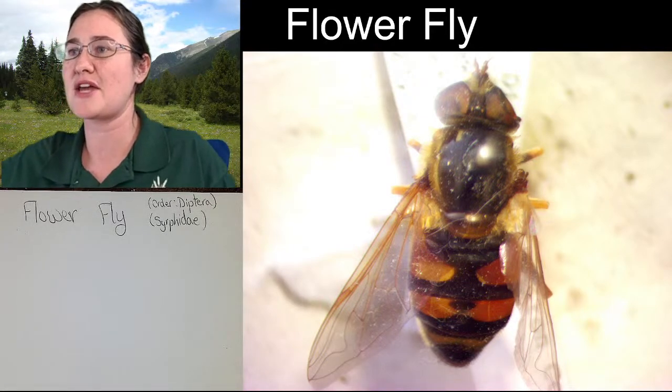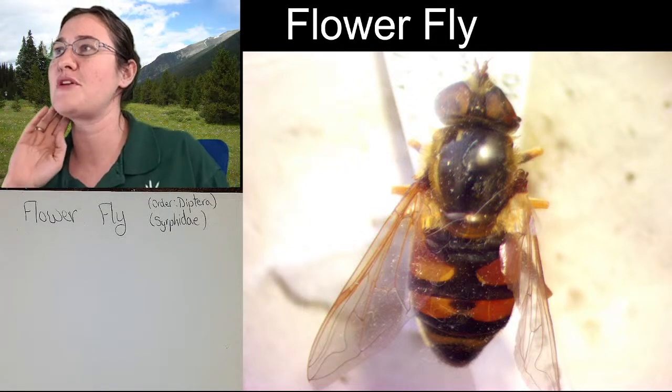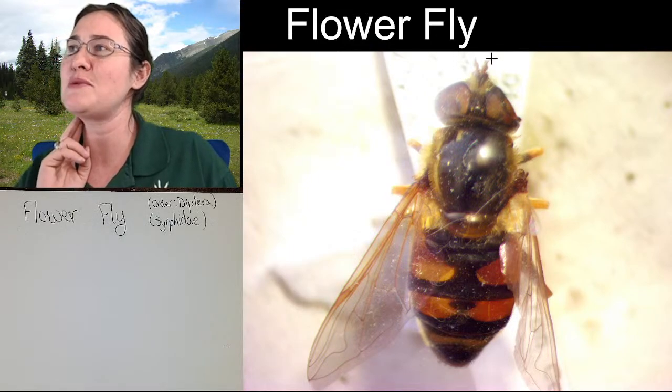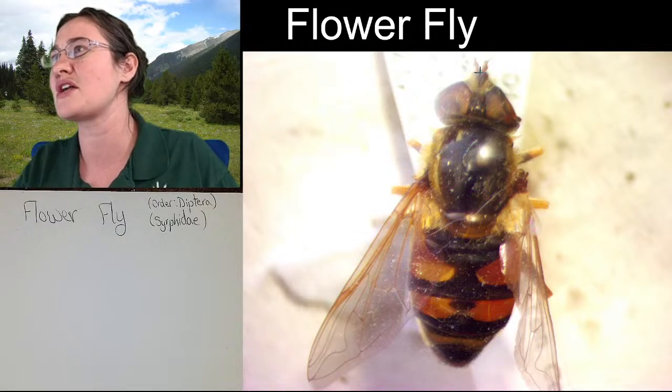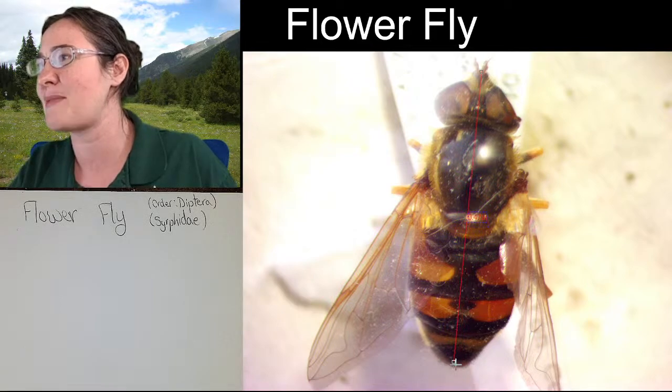All right. So I'm going to just start off by giving us a light sketch of the specimen. I do want to make sure that we measure our specimen from the front of the head to the back of the abdomen. I am not going to be taking into consideration those antenna here. So I'm starting around here, and I'm going to come down from the front of the head all the way to the back of the abdomen.